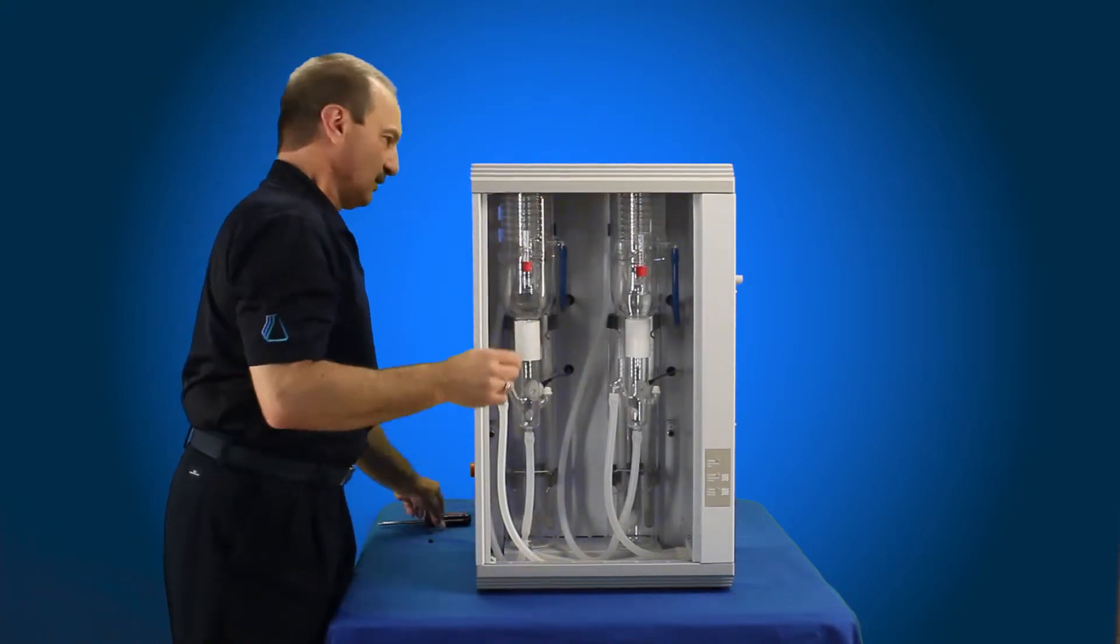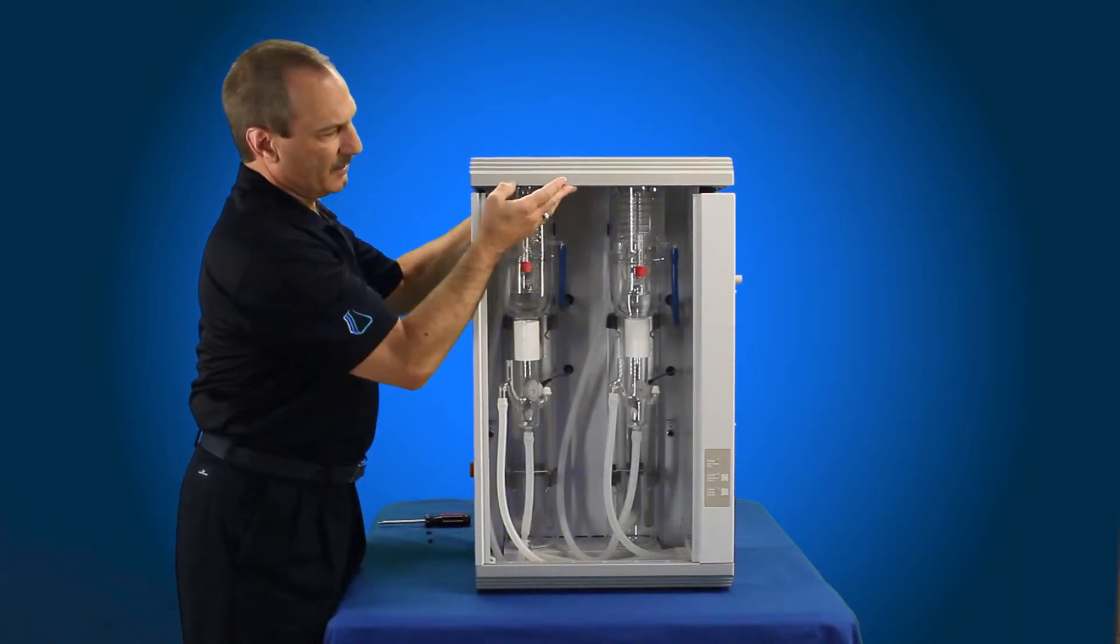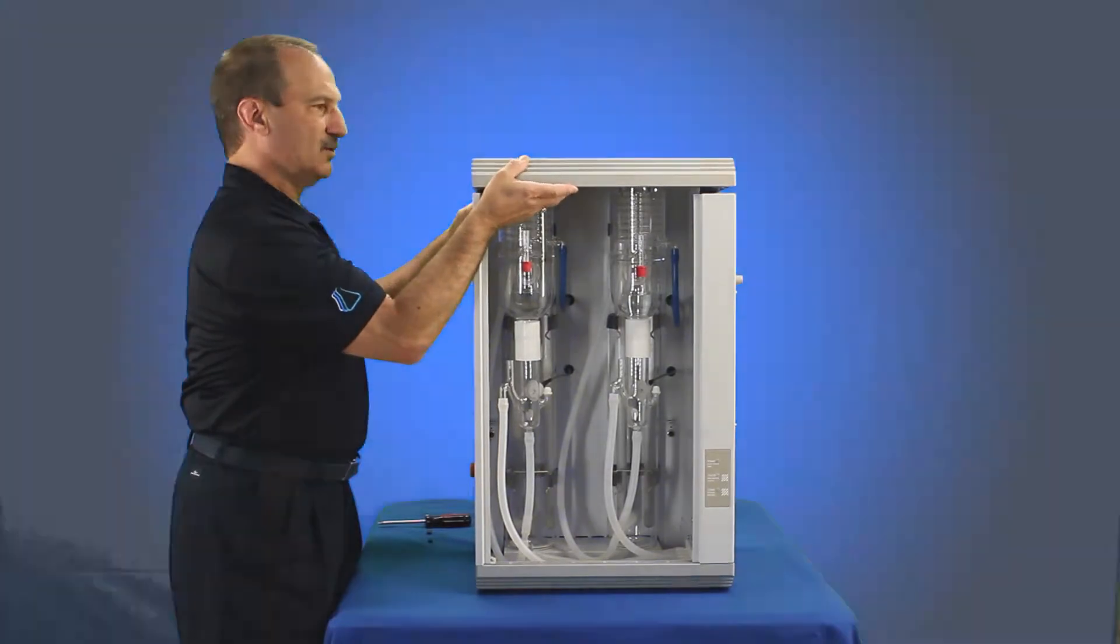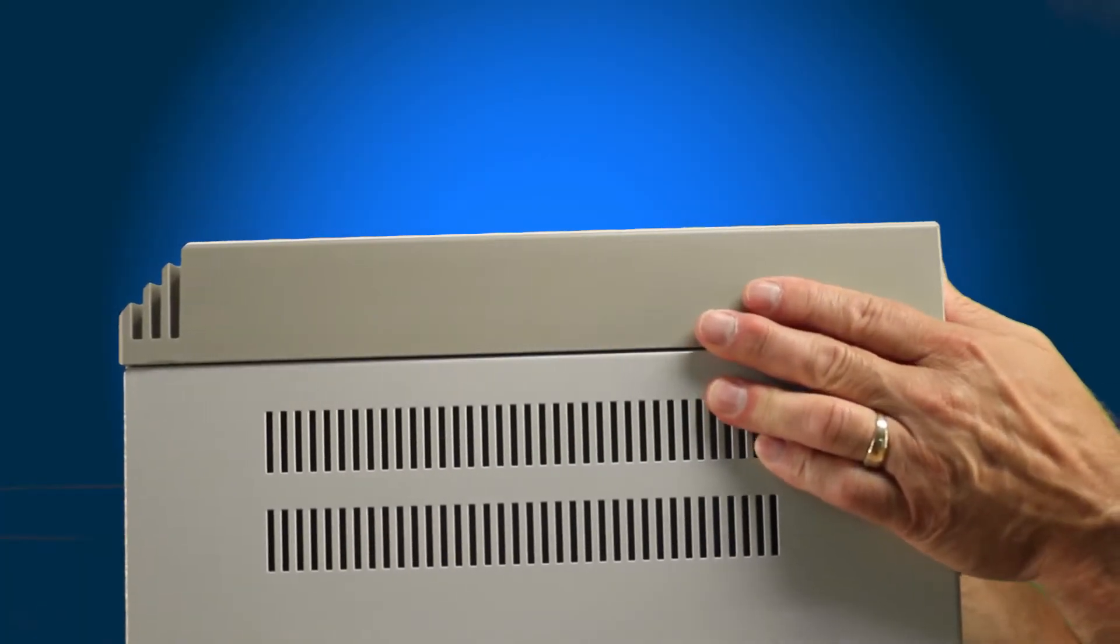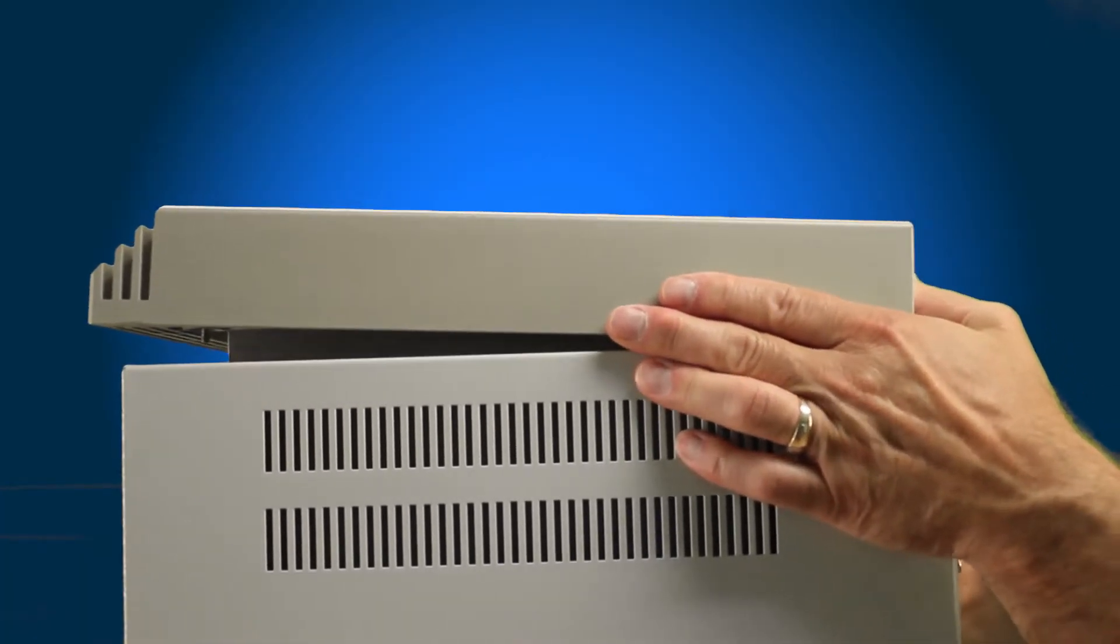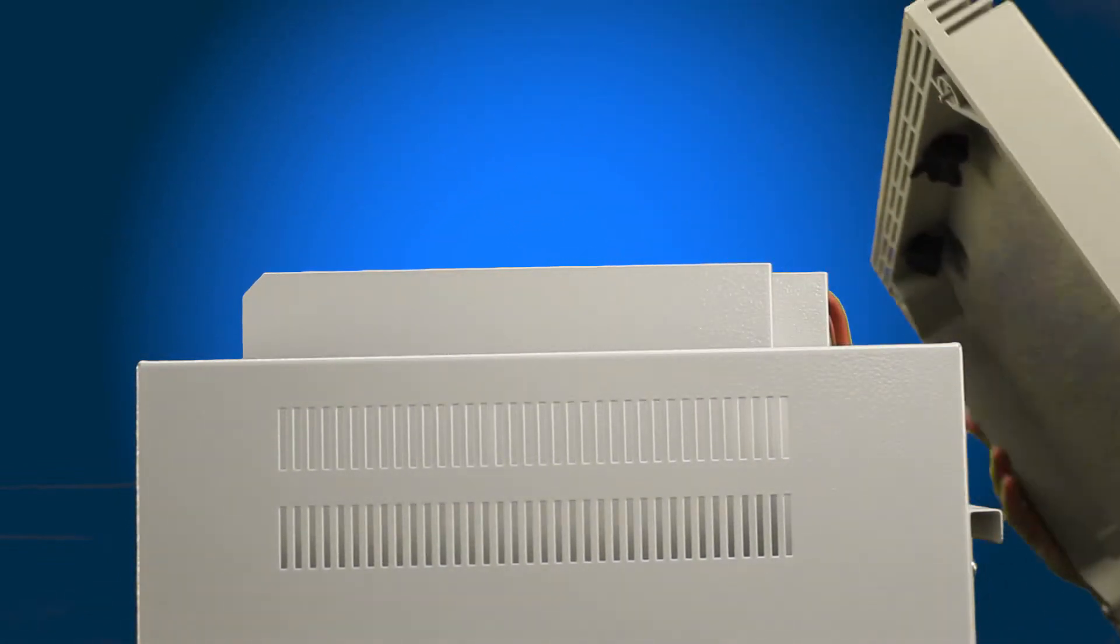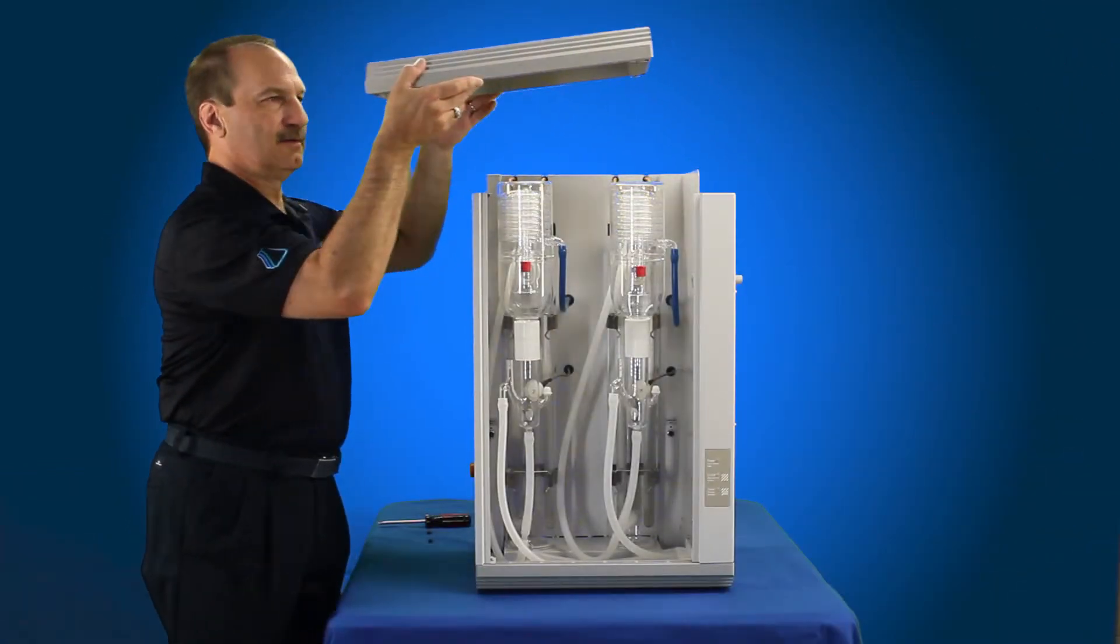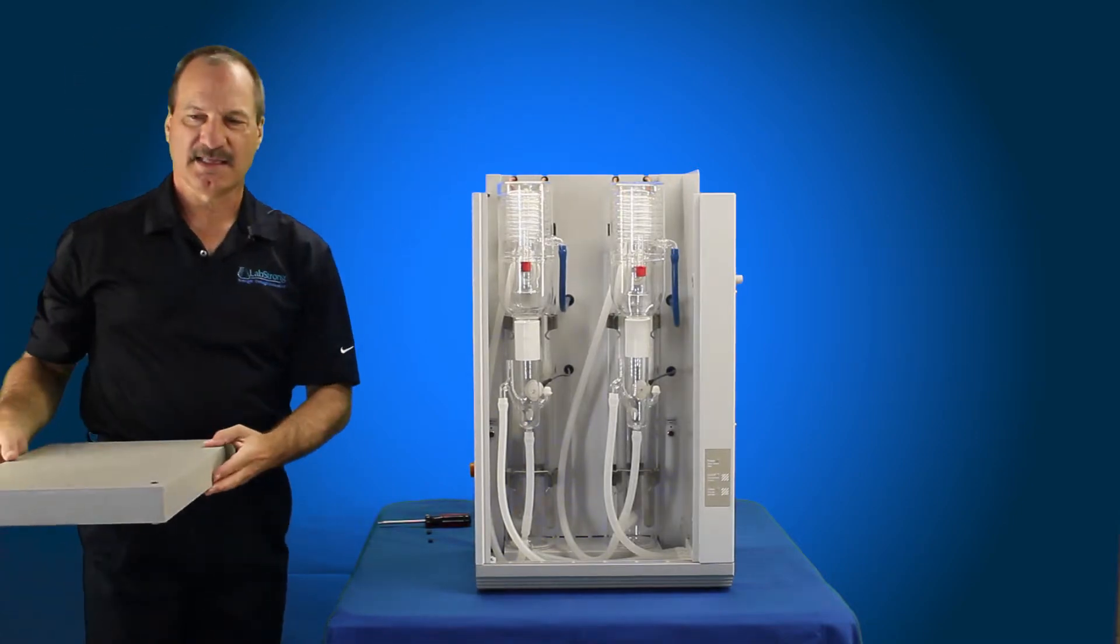Once those are loose, you can pop the front up, and then the back are just two bolts that are elongated and elongated holes. Just slide it ahead until you find the opening. And then pop the top cover off and remove it. Set that aside.